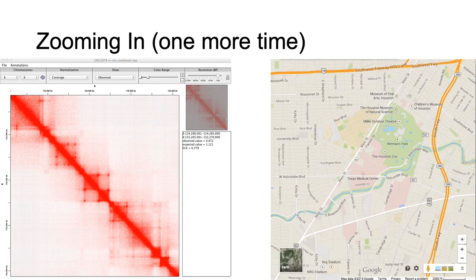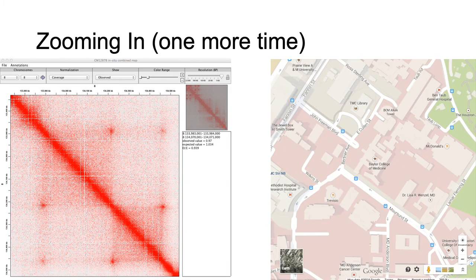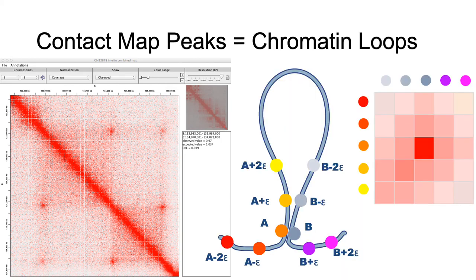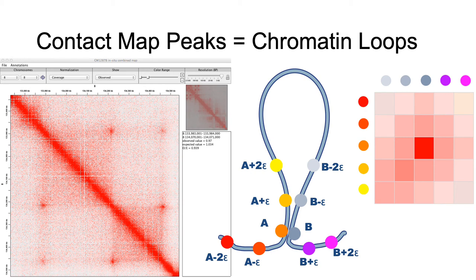Zooming in one more time on an individual loop, we can distinguish relevant marks associated with that loop, much as we can zoom in to a Google map and see an individual building. Here, we see that this area of focal enrichment is equivalent to a chromatin loop.